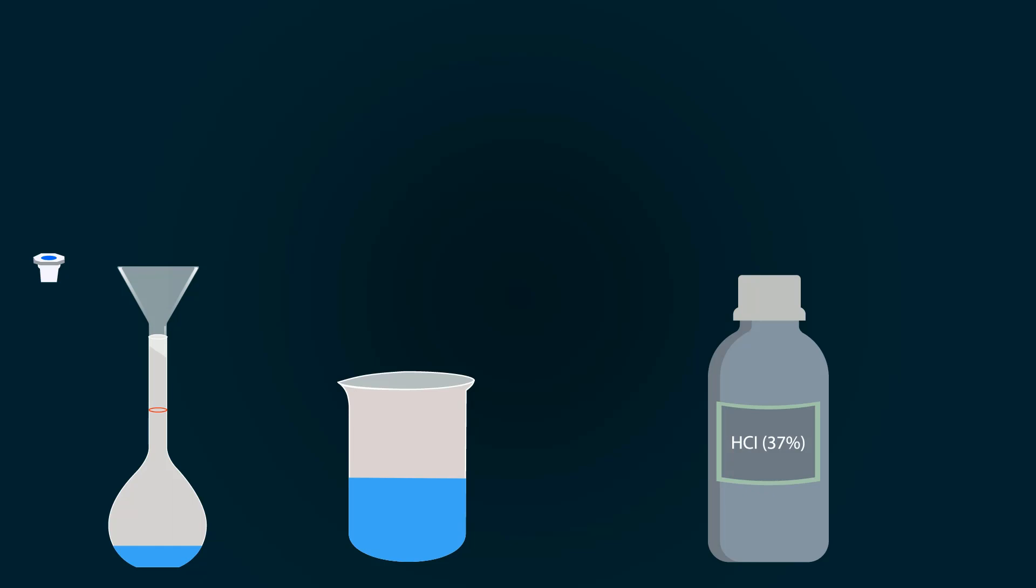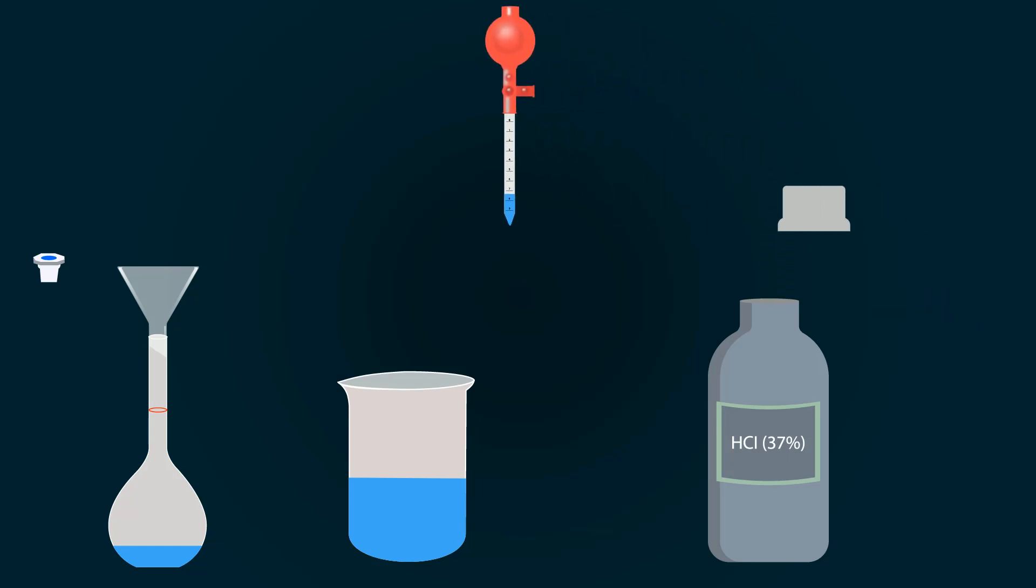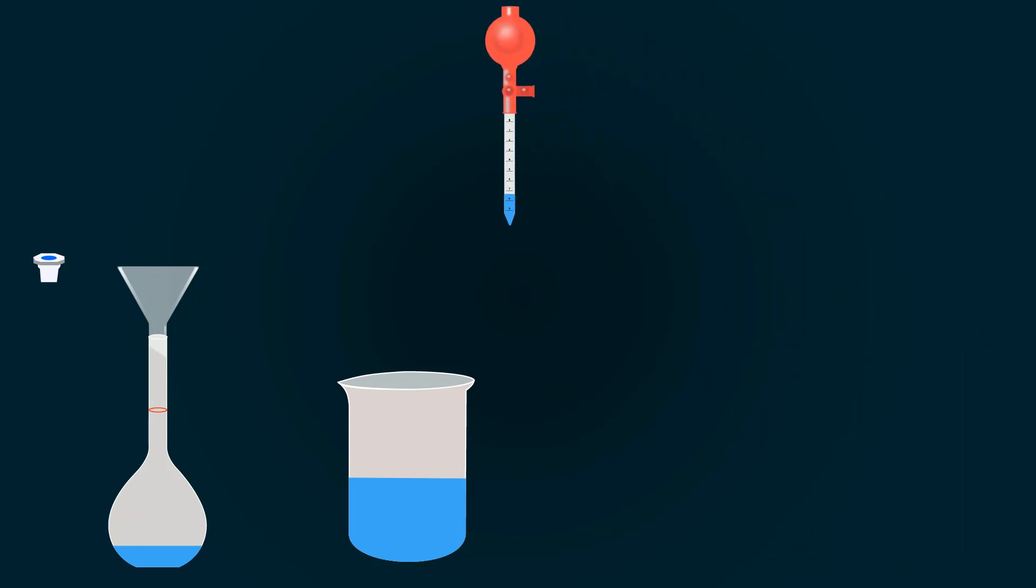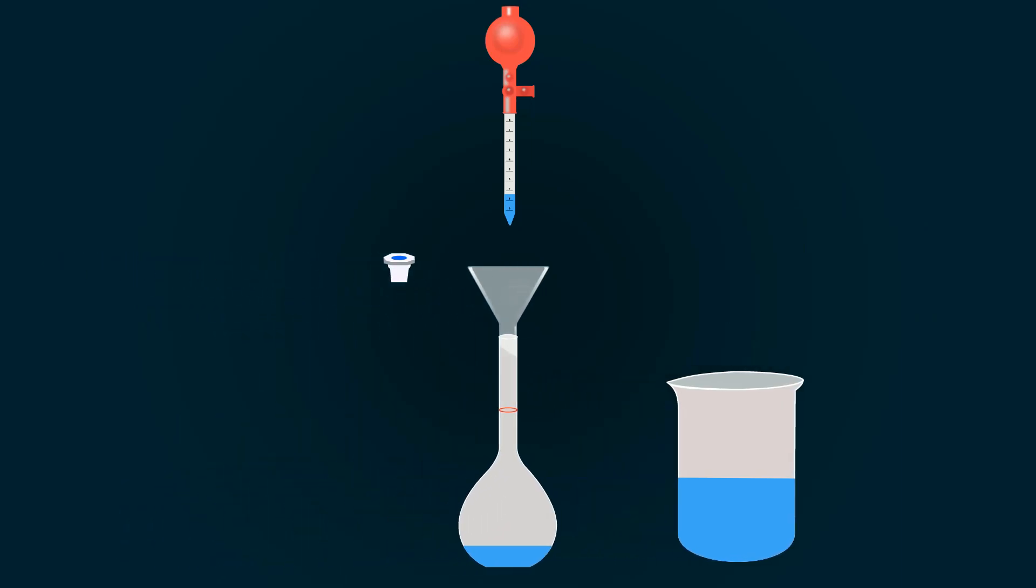Now pipette out this HCl into the volumetric flask.